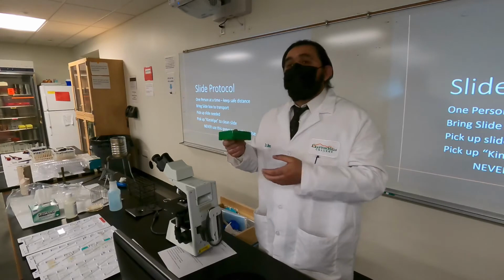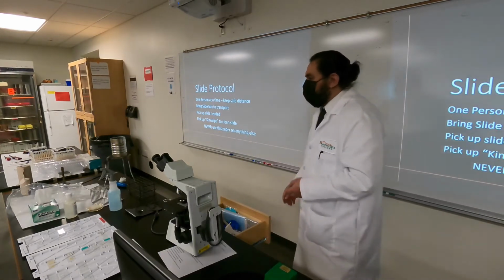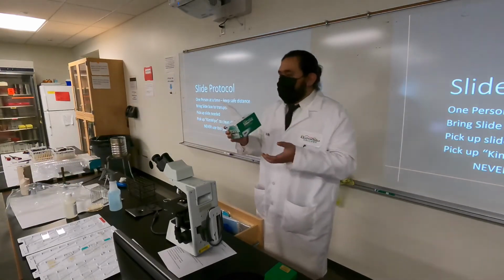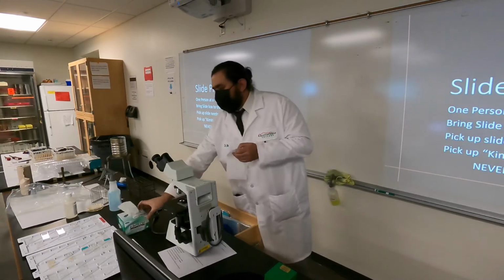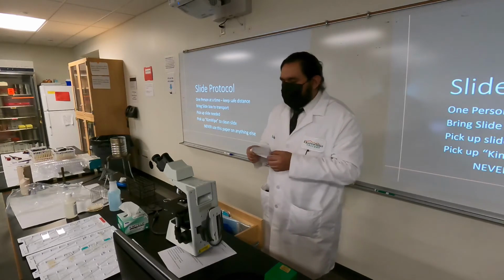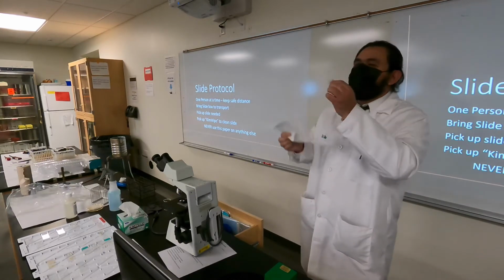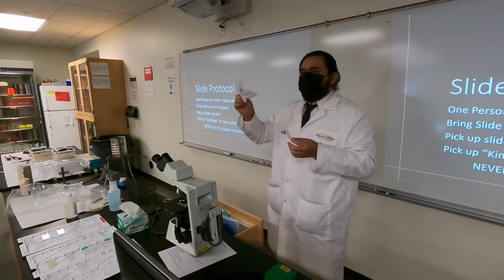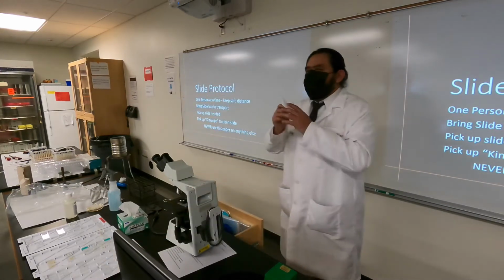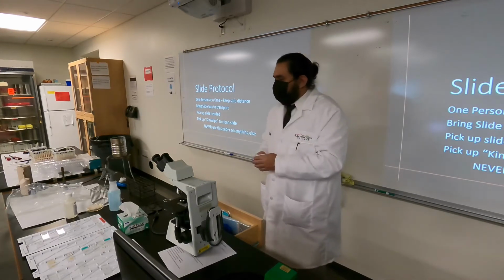If you want to store your other used slides that you've done before, you can toss them in there too, okay? But when you pick this up, make sure that you come and pick up one little sheet of Kimwipe. You don't need many, you just need one. Because again, these are designed to polish things. They're not meant to clean, they'll scratch things. So when you're using your slides, these will be very handy to remove any extra oil or any stains or fingerprints off of them. Once you're done with these, you can throw them away, you can get more if you need it, but you don't want to have them laying around because you don't want to accidentally use it on an ocular and damage the lens itself. Okay, so that's going to be the plan.